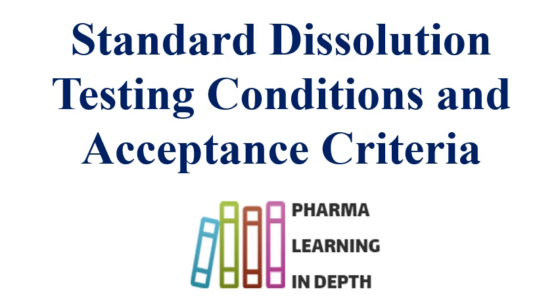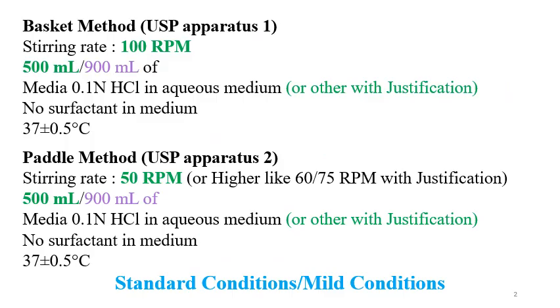standard conditions in detail. As per the regulatory authorities, for oral formulations, generally the basket method and paddle method are used.